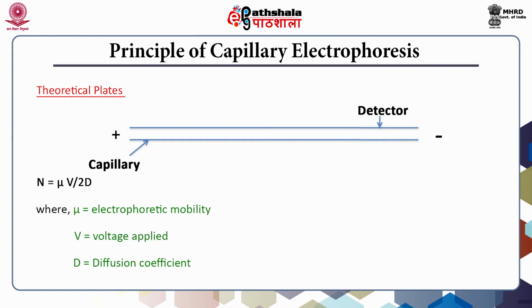Thus, in capillary electrophoresis, higher voltage will result in better resolution and reduced analysis time. The number of theoretical plates is also linearly related to electrophoretic mobility, μ, and inversely related to the diffusion coefficient of the solute, that is, the separated molecules in the buffer.